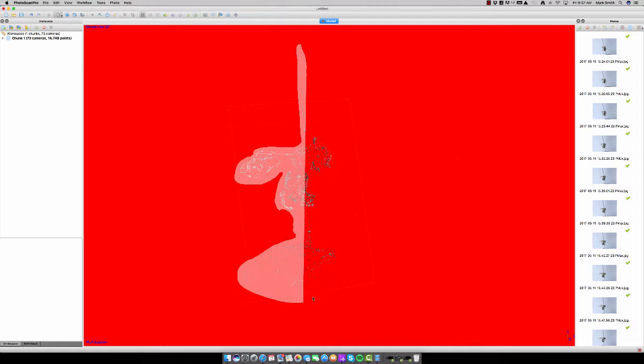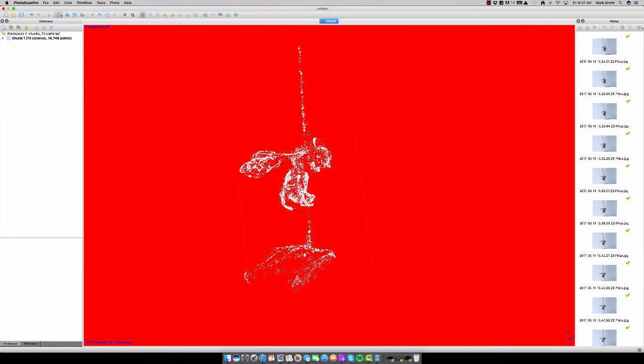You want to hit the X to eliminate those pixels. Now, if you want to do it the other way, let's say you want to just select the pixels that represent your known specimen. One thing you can do is just draw around it, and I think we're going to leave the stage in here for this step. Keep drawing around it, go in and under with that loose white one, and then you can also crop. So what we're going to do is crop, and that's going to eliminate any other pixels.